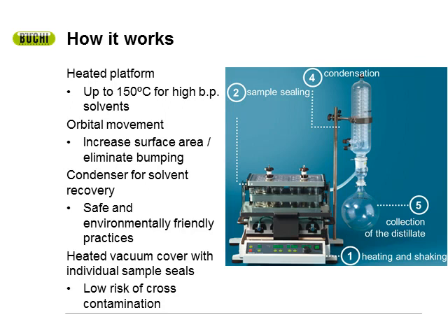Next, you can see we have the condenser on the right-hand side here. This is what actually condenses the vapors back to the liquid form. Remember, this is the energy out of the system in the form of cooling. You can see that the vapors will be condensed into its own single receiving flask. From there, they can be safely and properly disposed of to your liking.